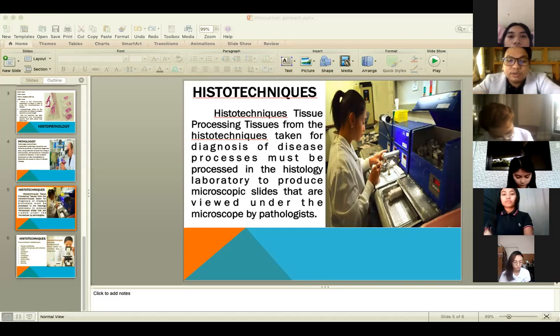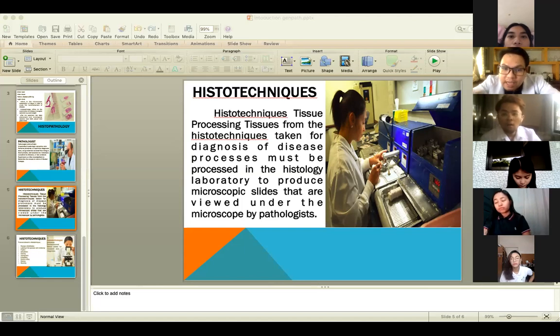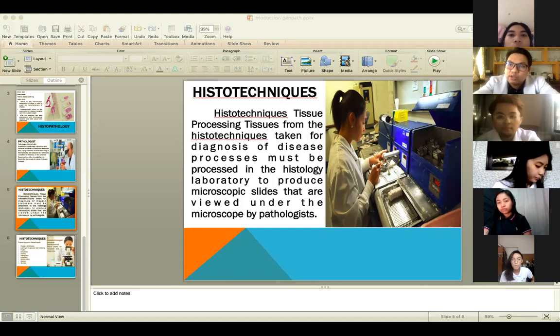That is also, ano pa rin siya? Spreading pa rin niya. Okay? Question so far. Okay? So this is streaking, zigzag motion on a slide. Okay? Spreading, ito yung AFB. Diba? Wire loop, specimen, and then you perform circular motion from inside to outside.